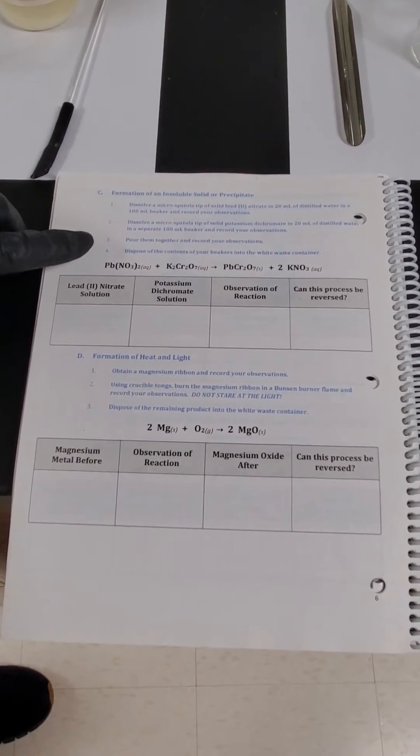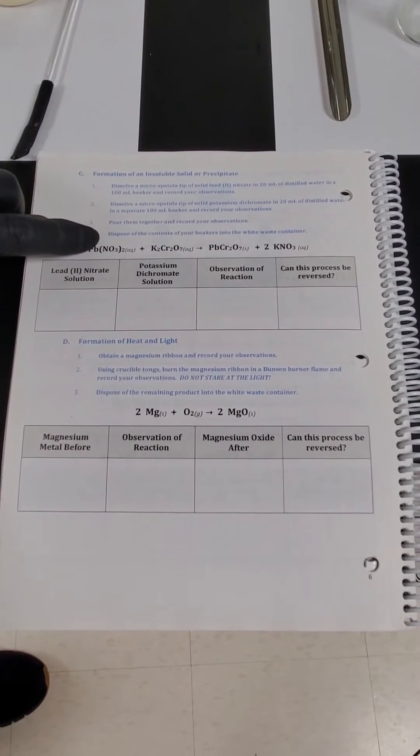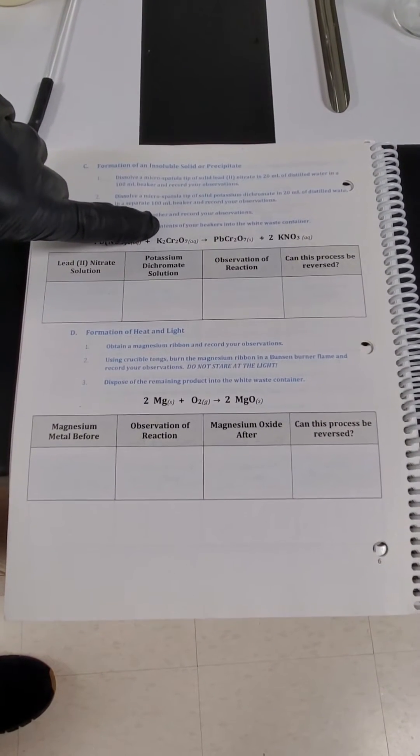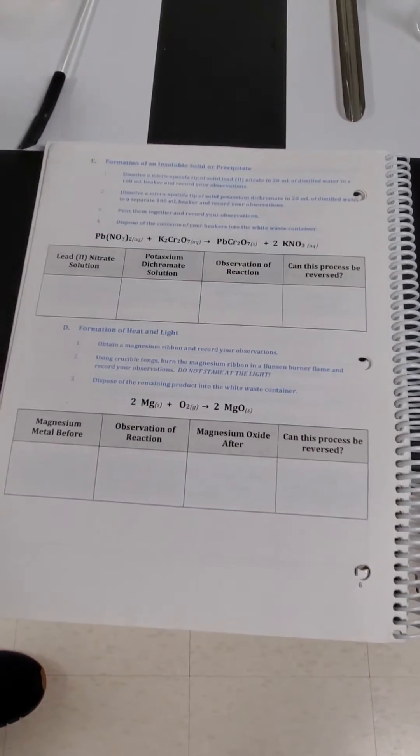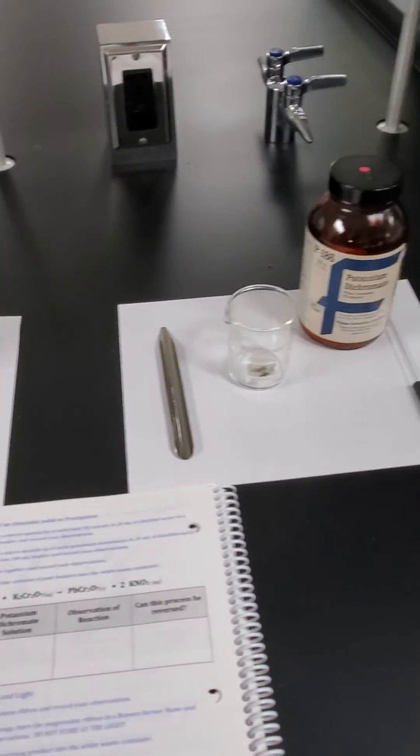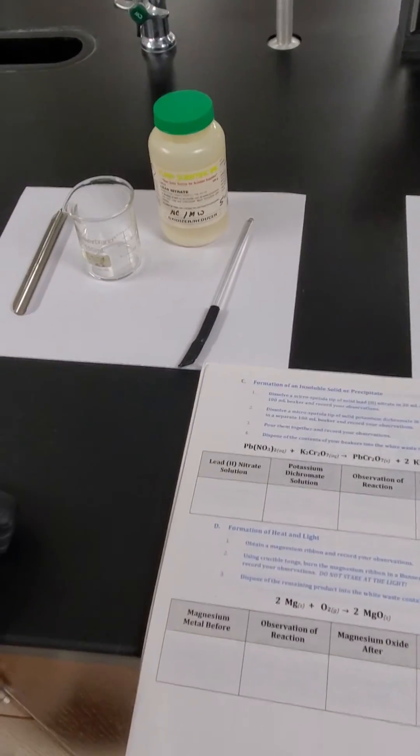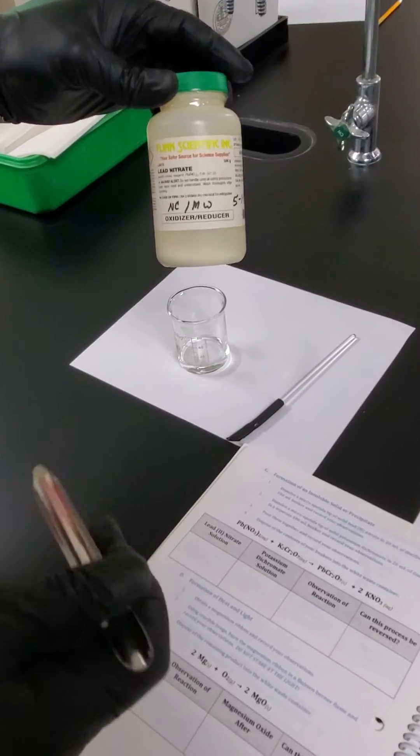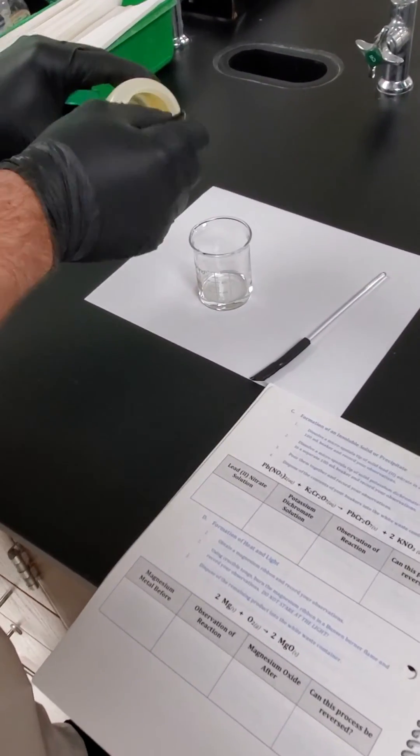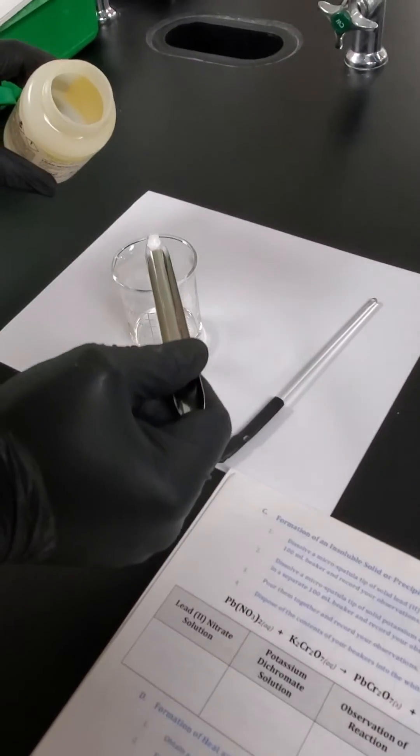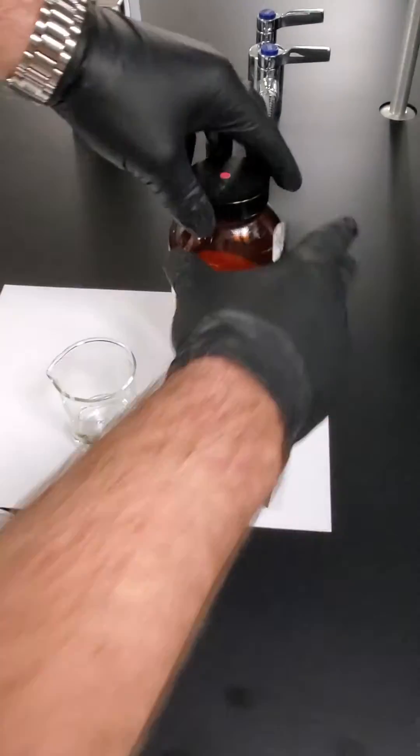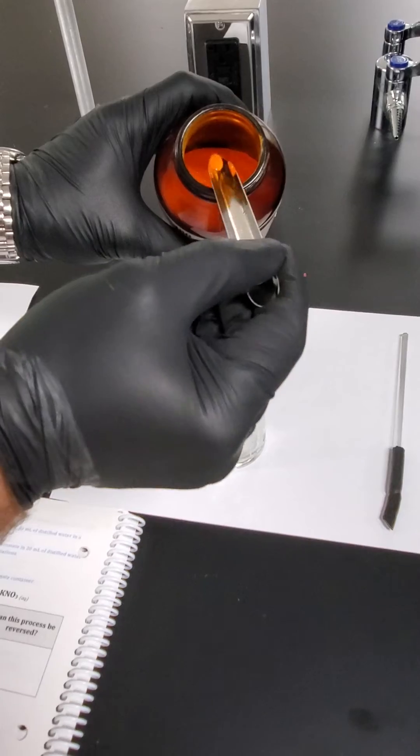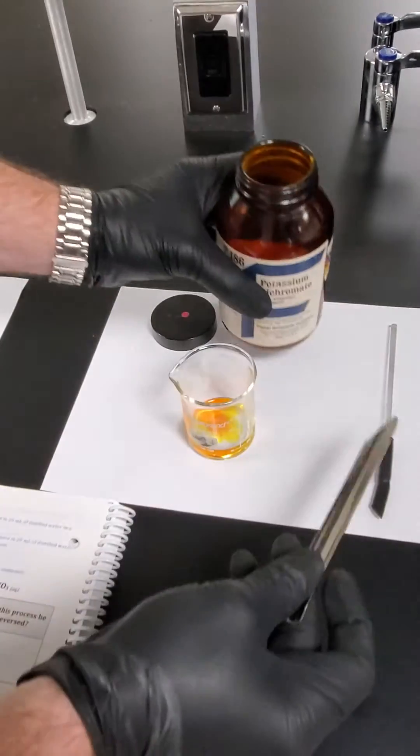Alright in part C we're still looking for is it reversible or not. We're going to take lead nitrate, make a solution with water. Potassium dichromate, make a solution with water and then mix them together. And think about could they be reversed. So let's make these solutions first. I'll do that by adding some water to each of those beakers, 20 ml each. And then add some of that compound and stir it up to be homogeneous. Alright so we're going to take a little bit of the lead nitrate. Add it to our water. Notice it's just a kind of white powder. Do the same thing with potassium dichromate. Add it to a little bit of water. And then we'll stir it up. Alright we'll be back in a bit.